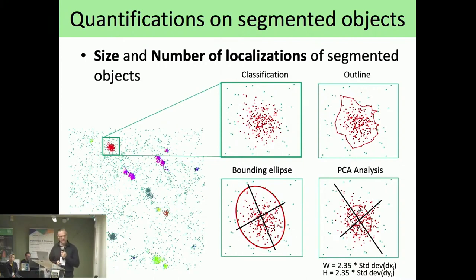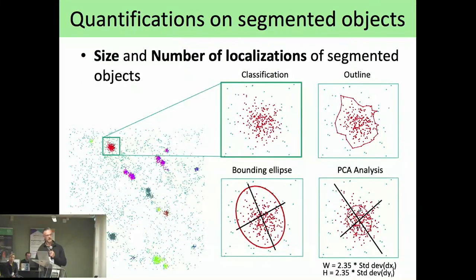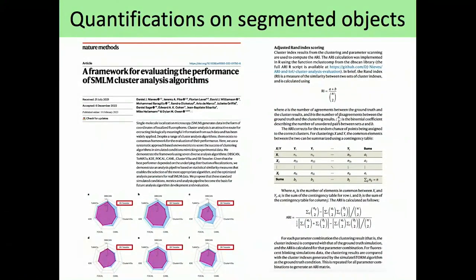Of course, the question that we all have behind, it has also been discussed a little bit during the other presentation, is the clustering thing I wanted to highlight. Similar to localization, though a bit less, a lot of techniques have been developed and are still under development for clustering, which is a very hot topic, directly from the coordinates. And again, there's the work from the group of Dylan that regroups a few people in the field and tries to come up with some data sets, metrics and different scenarios to be able to assess the efficiency of the given algorithms for segmentation.